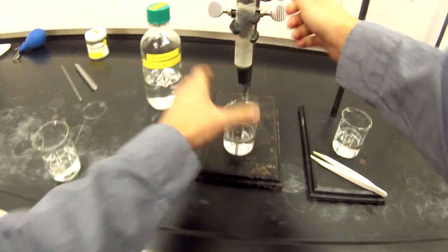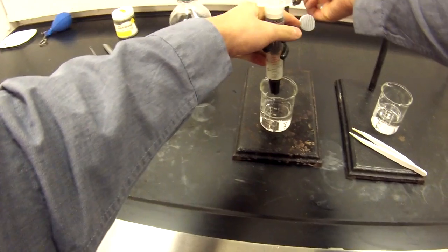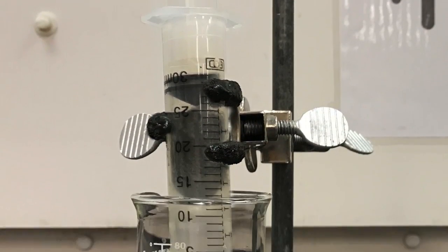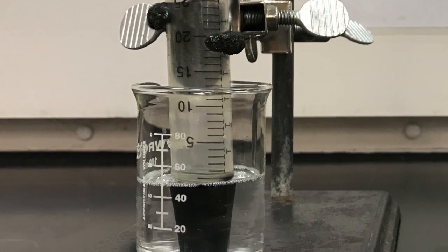And then we're going to secure that into our three-prong clamp. Then we're going to soak the tip of the syringe into our detergent solution. That should be the setup that you should expect to have once you have your syringes set.